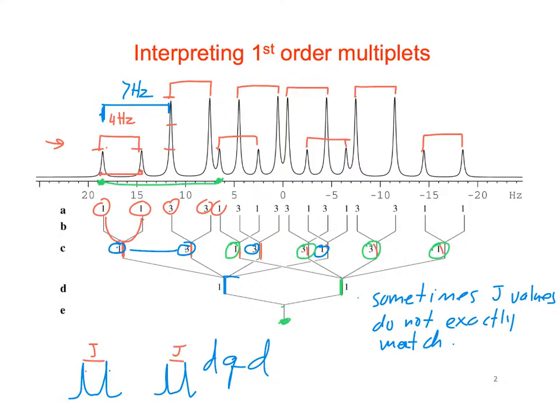The way they move around and solve it. No, it's not really. The solvent shouldn't affect the coupling constants, the distances. Like as the molecule moves. Yeah, but even if it did, then you're not going to change one coupling constant without changing the other, because that process or that effect is felt by both of those protons.